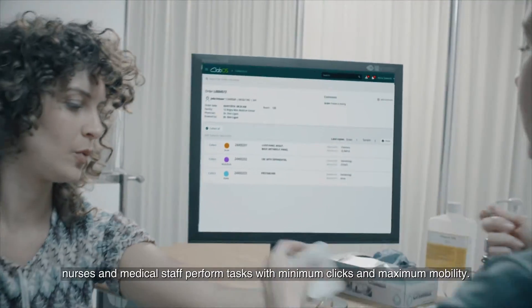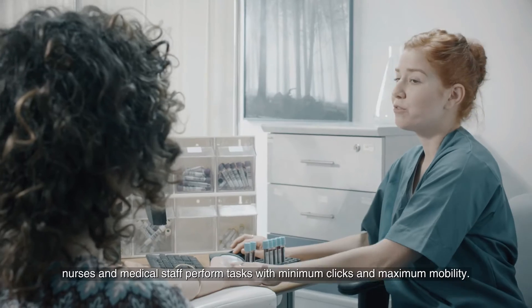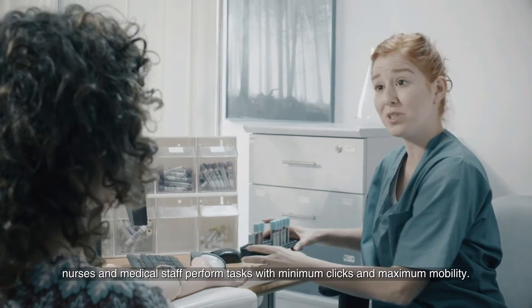At the patient service center, nurses and medical staff perform tasks with minimum clicks and maximum mobility.